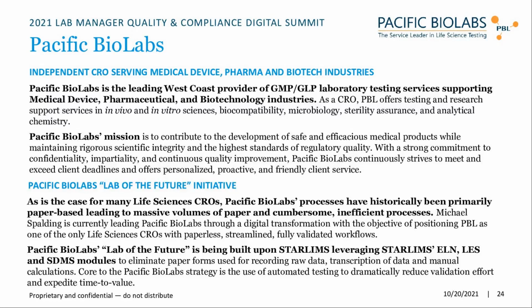But I'm also extremely passionate about this next statement, about the project that we're leading here, the Lab of the Future initiative. And this was something that I was also involved in implementing at SGS. Life sciences CROs have traditionally been very heavily paper-based, with massive volumes of paper and cumbersome processes. What I'm leading now is an initiative to transform our processes to digital, paperless processes.